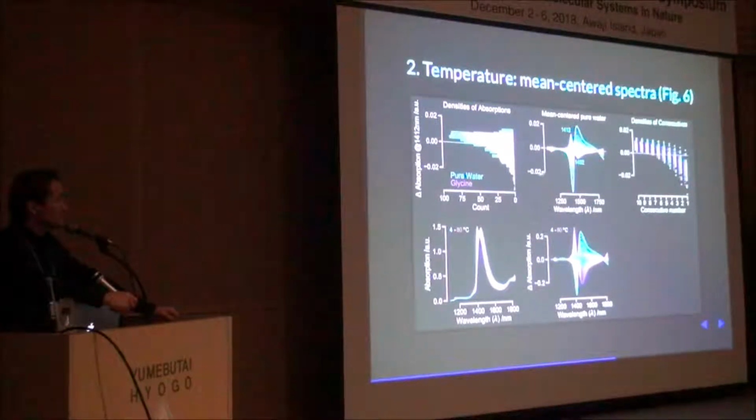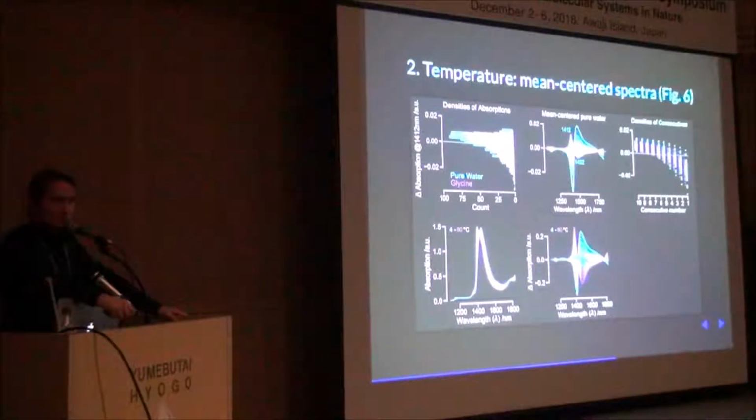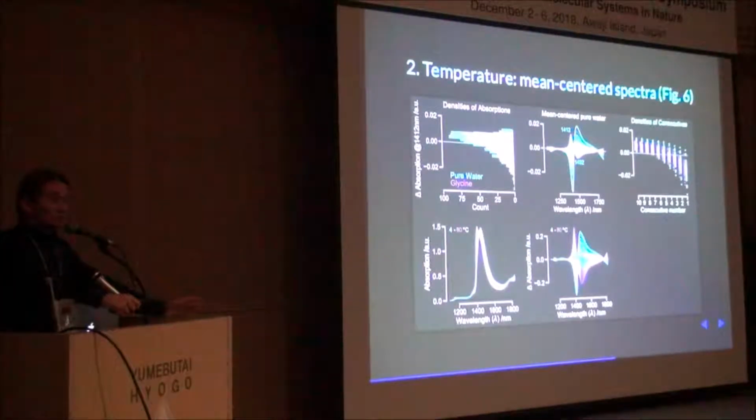And here is my point. This is the second decimal. So with the first decimal, we were at the concentration change, and with the second decimal, room temperature. So these are actually not big changes. You can only imagine that with larger changes, if you're not regulating the temperature of your sample, this will blow up to higher values. But here, basically, this is the evidence. We're at the second decimal with temperature.